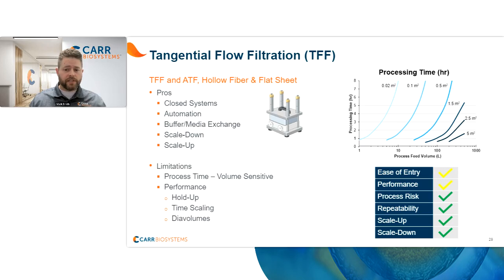Overall, tangential flow filtration meets the performance very nicely. While it's maybe not the easiest thing to enter with and may have some performance challenges, it goes well across the board for cell handling.